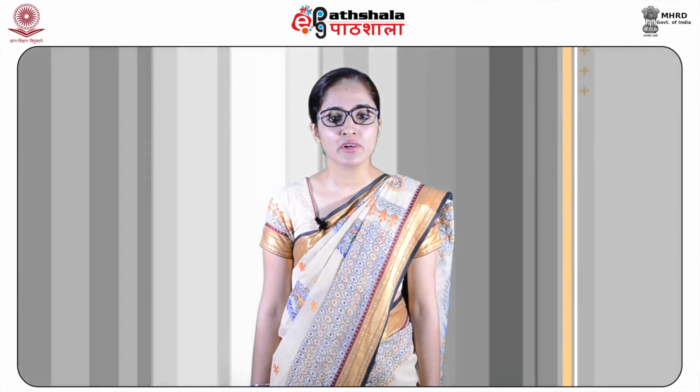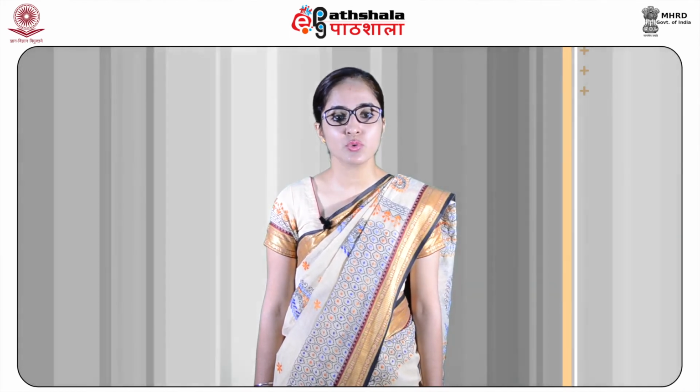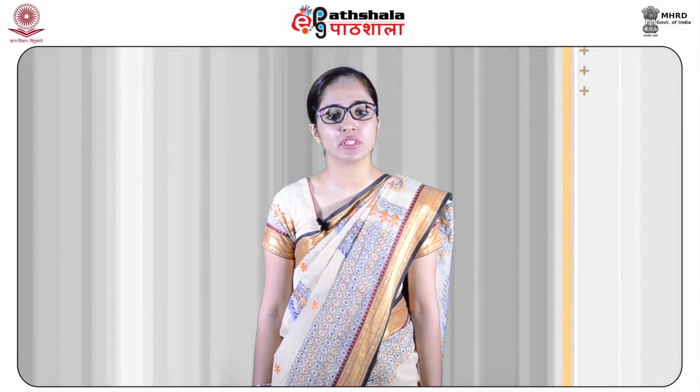In one-dimensional proton NMR, there are two axes. One represents the chemical shift and the other the intensity of the signal, whereas in 2D NMR spectroscopy, there are three axes. Out of these, two axes represent the chemical shift and the third one represents the intensity of the signal. In COSY experiments, both axes have chemical shifts of the protons, whereas in HETCOR the chemical shift range of the proton is plotted on one axis and the chemical shift range of the 13C is plotted on the second one. Thus, COSY identifies pairs of protons which are coupled to each other. HETCOR, on the other hand, is used to identify carbon atoms and the protons directly attached to them.